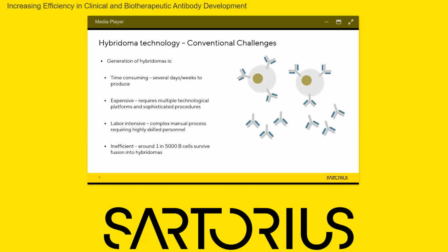However, for all the benefits of this particular type of technology, there are drawbacks as well, and some of those are listed here. So the generation of hybridomas is very time consuming. It takes several days to weeks to produce a hybridoma.